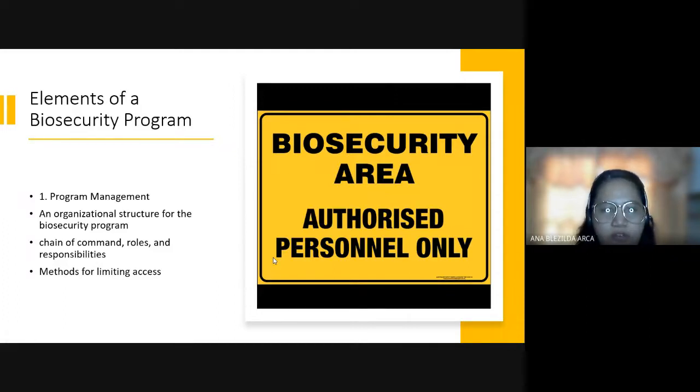First of all, you must have a program management. So dapat meron kayong mga standard procedure pagdating sa biosecurity. You must have an organizational structure. You must have a chain of command, roles and responsibilities. Sino ba yung mga staff in charge sa biosecurity? And methods of limiting access inside the laboratory. Kaya nga may sabi tayo na authorized personnel only.